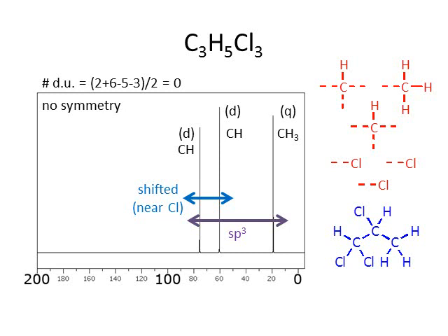In fact, we could even go a little bit further and remember I said that being sp3 is generally like 0 to 70. This one's a little further to the left than 70, but notice one of my carbons is close to 2 chlorines and the other one is close to 1. You might expect that being close to 2 chlorines, if one chlorine shifts things a little, 2 chlorines will shift things more. And so we could even figure out that this signal represents the carbon with 2 chlorines, and this signal represents the one with 1 chlorine. We weren't asked to do that in this question. We just wanted to come up with the fact that this was 1,1,2-trichloropropane.